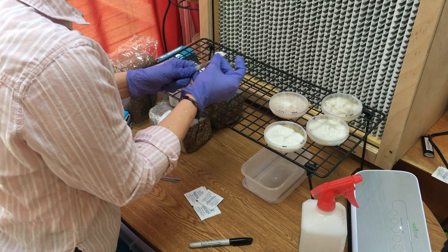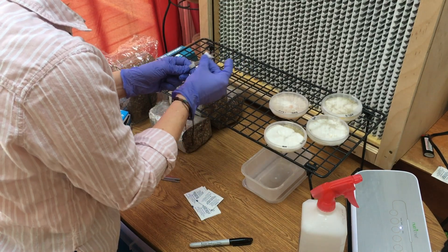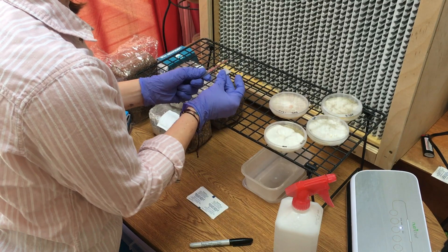Hi, Ashley here, and today I'm going to show you how to inoculate agar to a spawn bag. First, I recommend being in front of a laminar flow hood or in a sterile environment. Then, sanitize everything before you start.